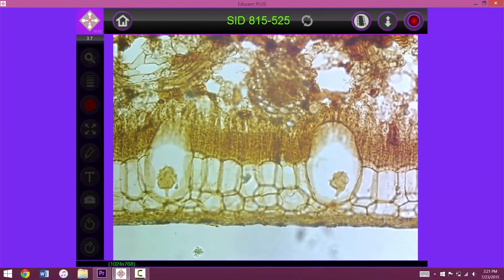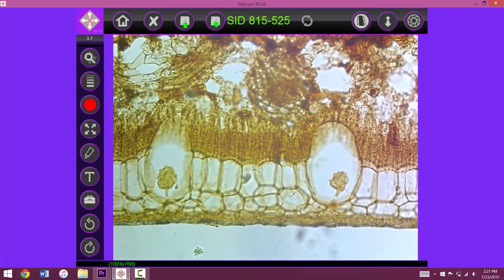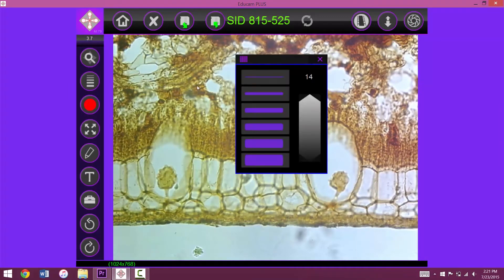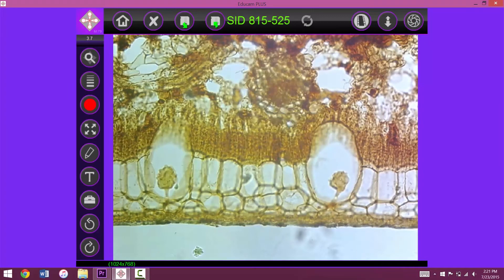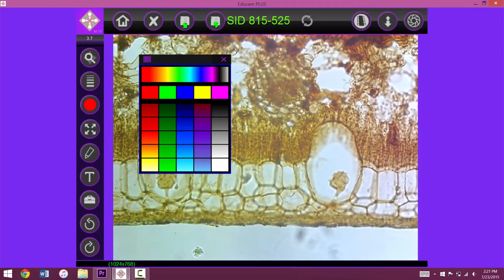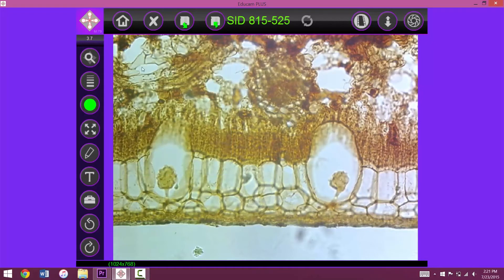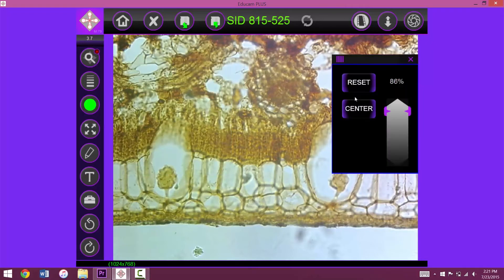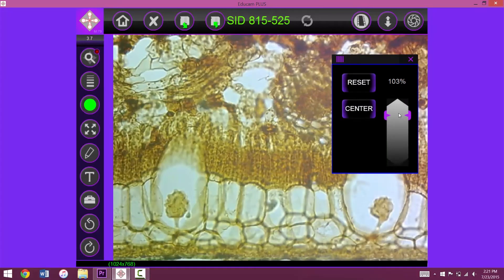From here, we can capture the live image, magnify the image, and identify the cell by determining a color, choosing a line thickness, and then use the drawing tool.